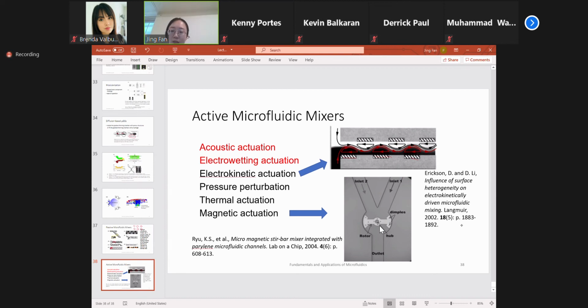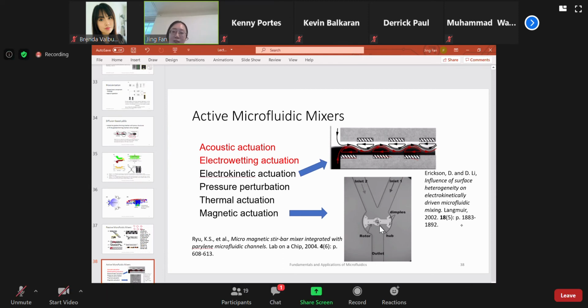We use syringe pumps for small volume flow rates. We can imagine that usually when we run the experiment, the pump runs very smoothly at a constant flow rate, so the fluid is also flowing very smoothly.